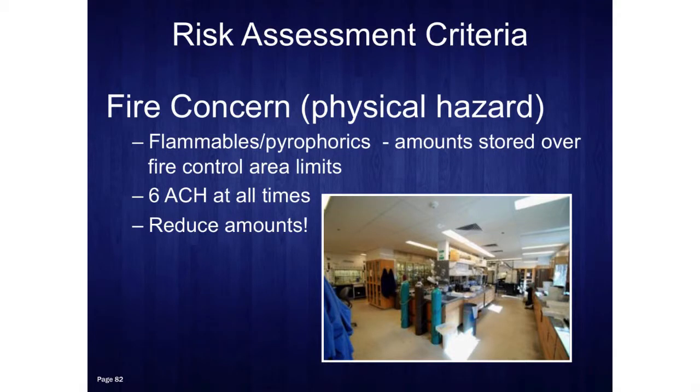So fire codes often limit the amounts of flammables and pyrophorics that can be in a lab. And if we have situations where we exceed those amounts, of course, we will not reduce air changes. What we will do is we'll reduce the amounts of those flammables and pyrophorics.